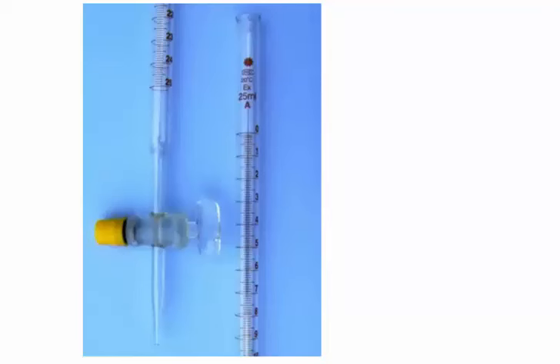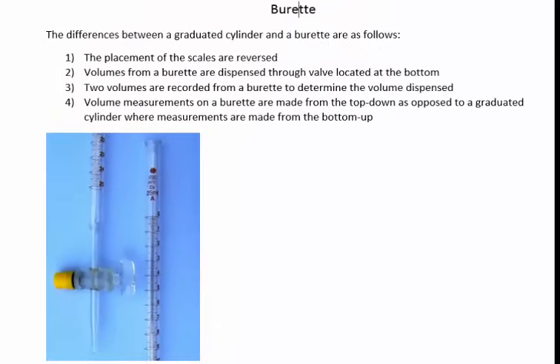The volumes from a burette are dispensed through a valve located at the bottom. Two volumes are recorded from a burette to determine the volume dispensed. Volume measurements on a burette are made from the top down, as opposed to a graduated cylinder, where measurements are made from the bottom up.